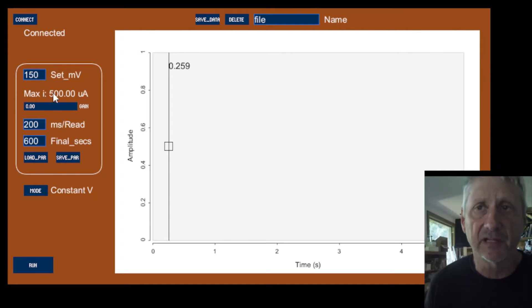That's not been tested. We need to get our hardware fixed before we really know the limits on our data. This is set to record a data point every 200 milliseconds, so five data points a second, but we can make that more granular. We can make it less granular. This is set up to record for a total of 10 minutes just because you don't want to leave this thing run overnight. I guess you could, but I don't really see a reason to do that.